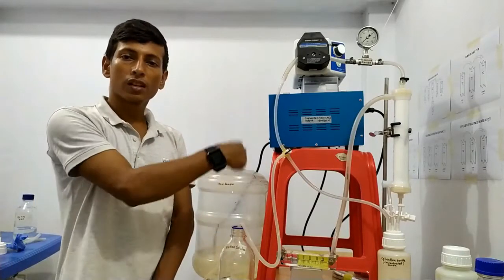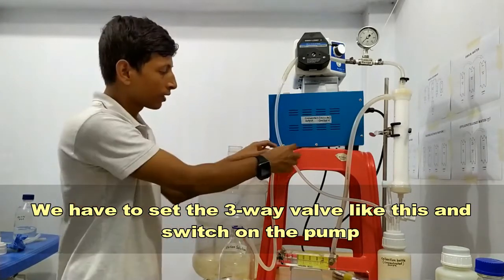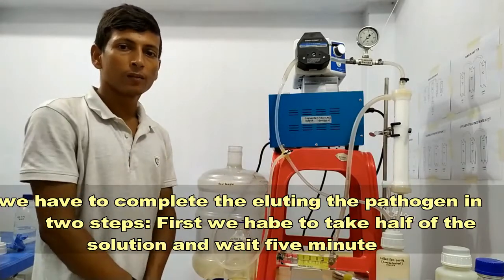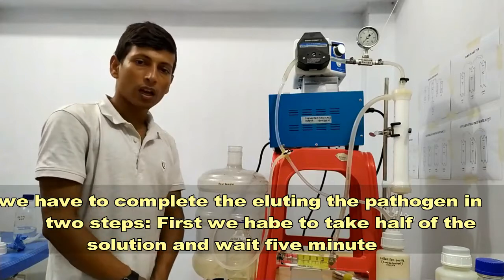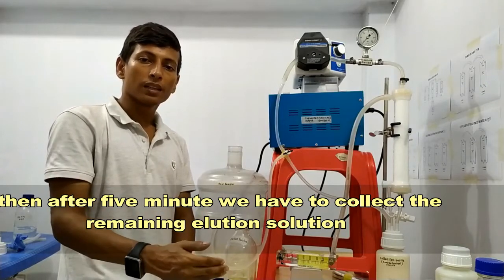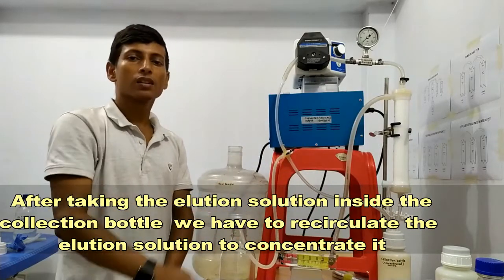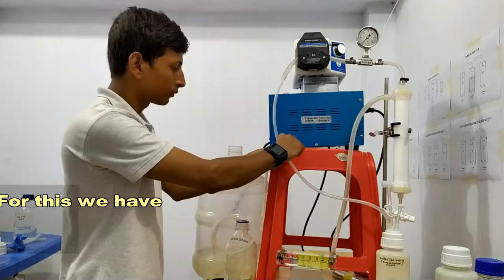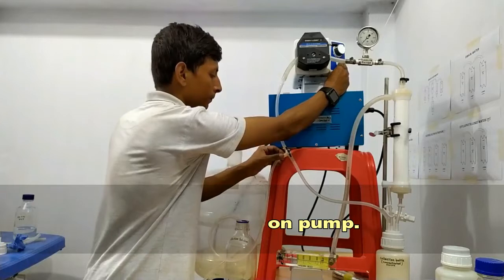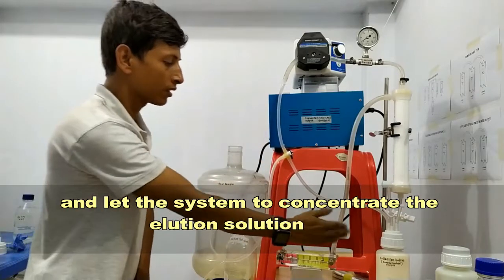We have to set the three-way valve and switch on the pump. We have to complete the elution of pathogen in two steps: first, collect half of the elution solution and wait five minutes; then collect the remaining elution solution. After taking the elution solution into the collection bottle, we have to recirculate the elution solution to concentrate it. For this, we change the three-way valve and switch on the pump to let the system concentrate the elution solution.